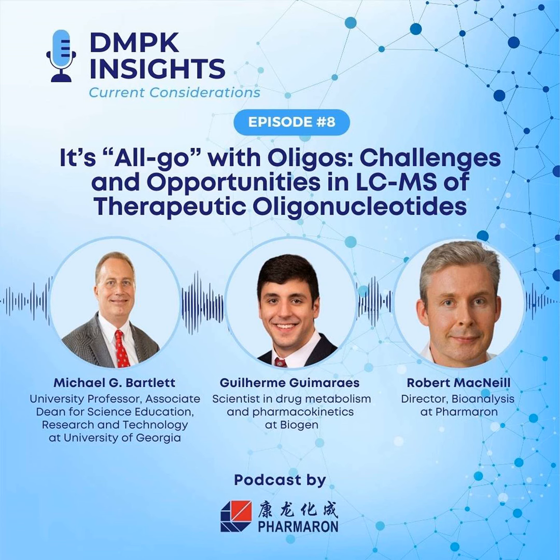I mean, I certainly think you're going to see people prefer solid phase extraction over liquid-liquid extraction, just because it's so much easier to automate. But I think your point is well taken that the instrument manufacturers have gone to actually developing oligo-specific kits now for people to use, so we're not being forced to adapt and use protein or peptide-based SPE formats like we had to for the longest time. So that certainly is going to do something for it.